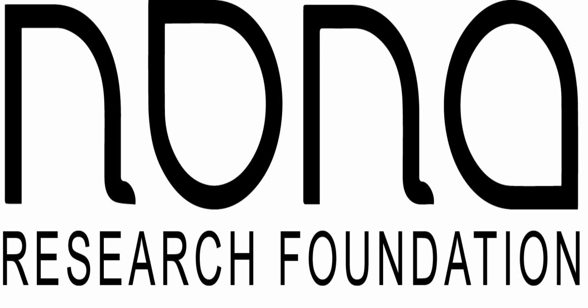Maybe there is something outside of this that we do. I've seen SiLA, Standards in Lab Automation, where they start to do some of the lab automation standards, as there are so many machines out there, and trying to get each one of them to work or get them configured is pretty much a fool's errand, because there are just new ones coming out all the time.